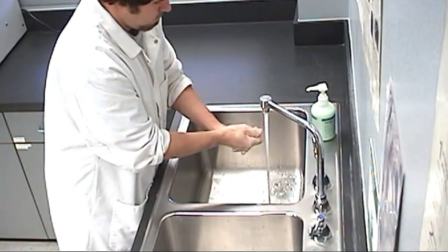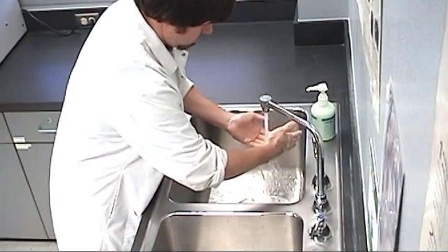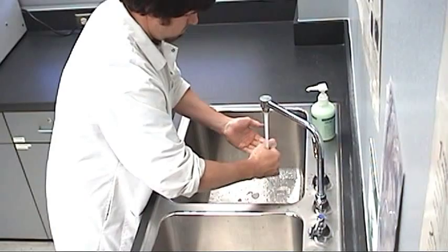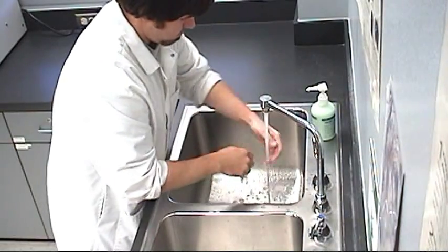When you have washed for the required time, rinse off the soap thoroughly. Ensure you do not touch the sink with your hands at any time. If you do, wash your hands again for another 15 seconds.